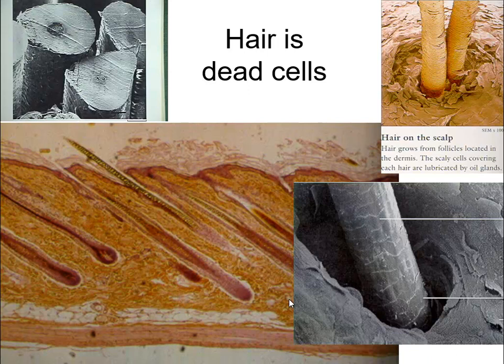At the top left there's a cross-section of a hair — you see a hollow place in the middle and then rings of squamous cells mostly full of keratin pushing out. At the bottom left is a slice through someone's scalp. On the surface you see dead squamous cells, and you can see where they've cut through to the bottom of the hair follicle. That's where the hair originates from down inside the tissue, and it grows up, pushes out, and erupts through the skin.